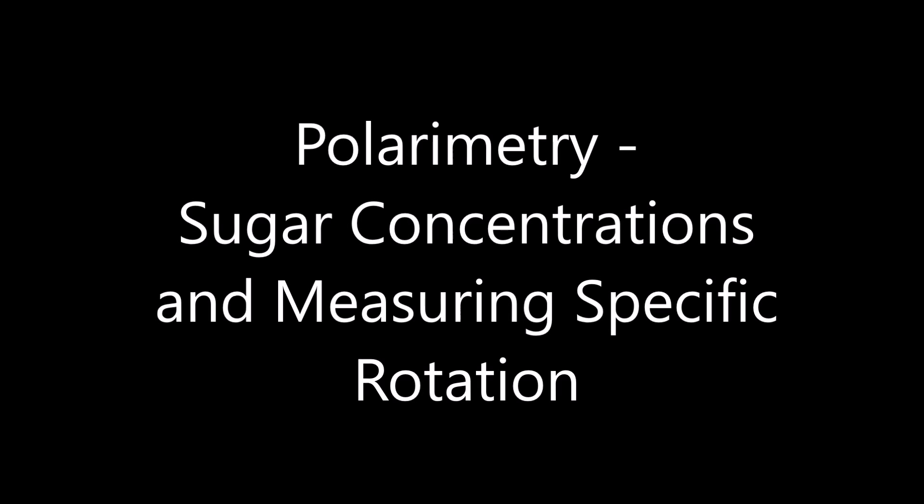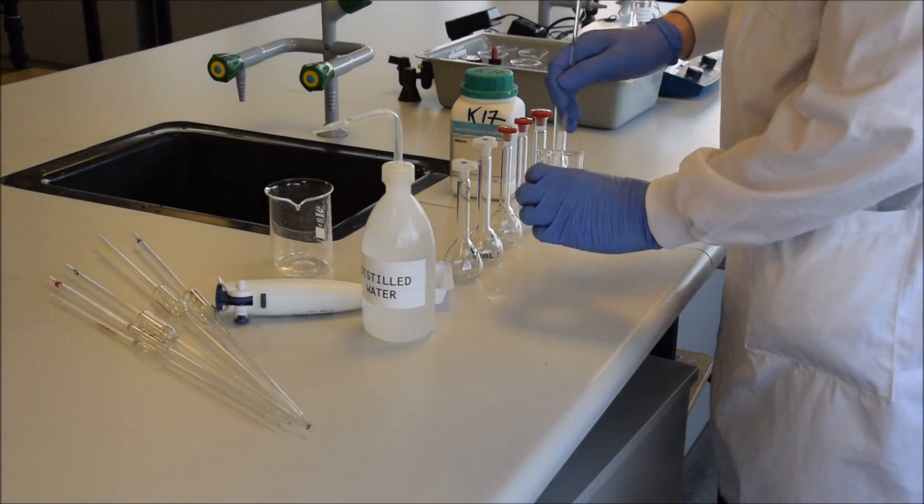Today we're going to learn about polarimetry. We're going to use polarimetry to measure a specific rotation and make a standard curve, and we're going to use that to measure concentrations of sugar.